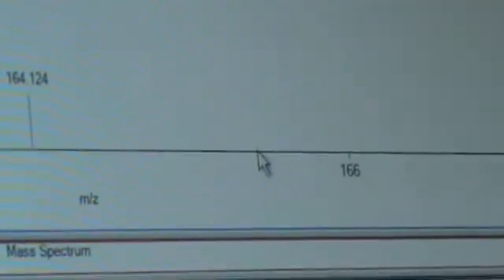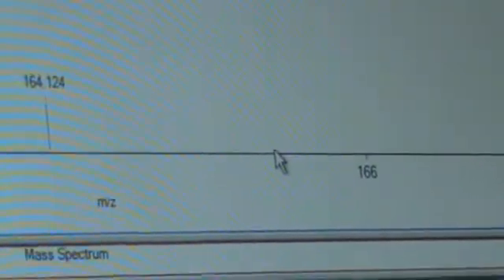So if we go back to our spectrum, what we see is nicotine at 163, the first isotope peak at 164, that's about 10% of that peak. Then we see another peak that's about 1%, just a tiny little blip at 165. And then somewhere out in here at 166, we should expect to see another very tiny peak, but it's sort of lost in the noise here, so I'm not sure we can identify that.